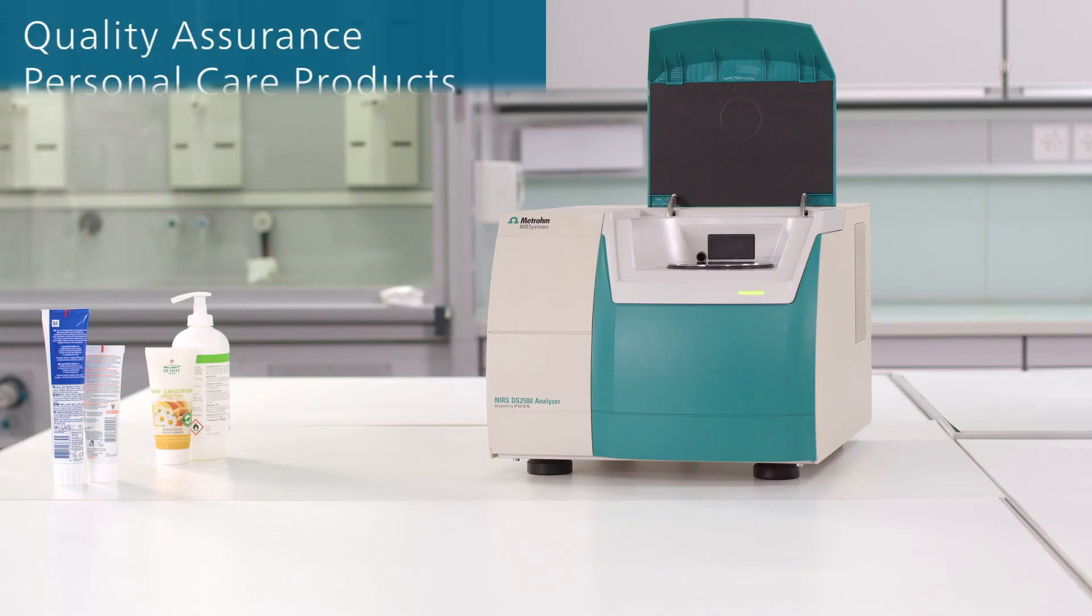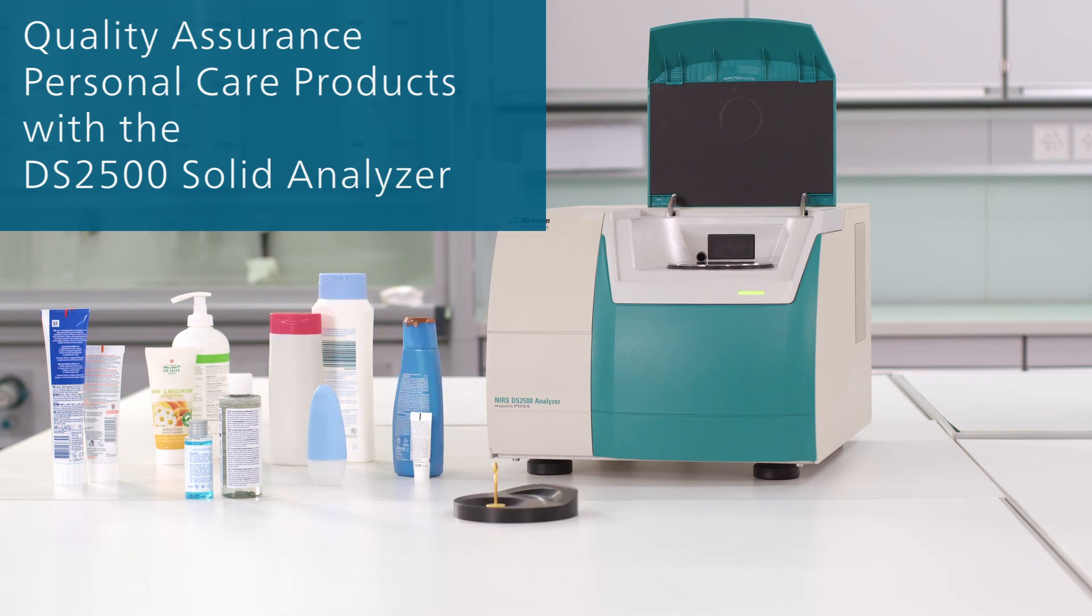Hi, I'm Andreas, and in this video I show you how to analyze multiple parameters in less than a minute with the DS2500 Solid Analyzer from Metrohm.